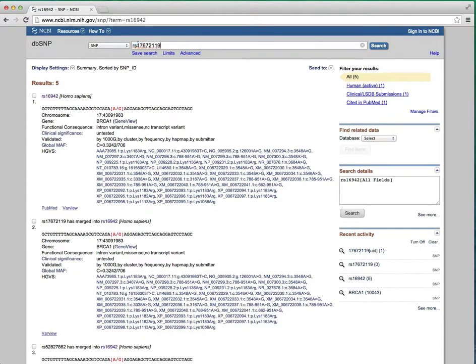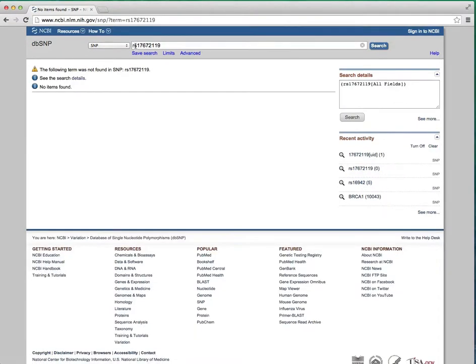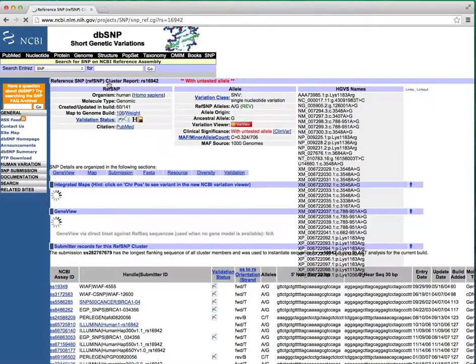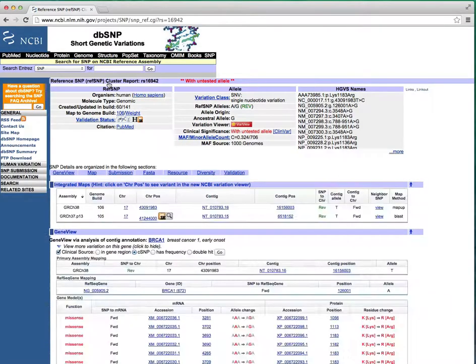Put this into the search box and you'll notice that the response says that this SNP doesn't exist. Remove the RS and it'll give you the correct response that it's been merged into this entry. Click on that link to take you to the report page for RS16942.